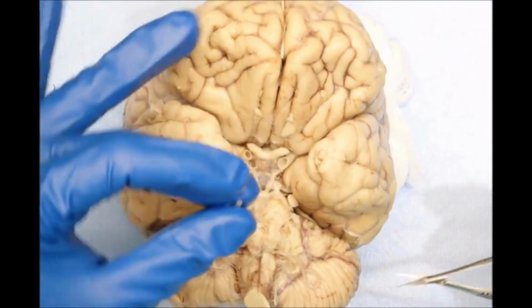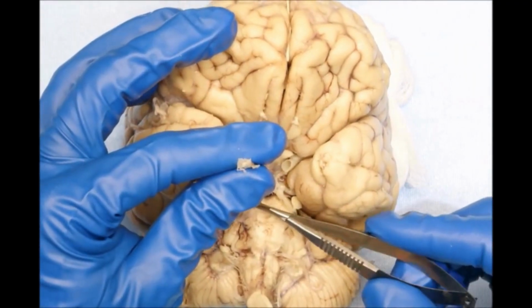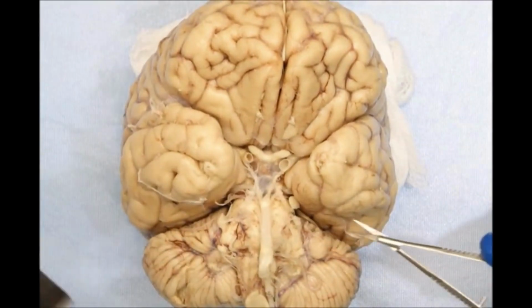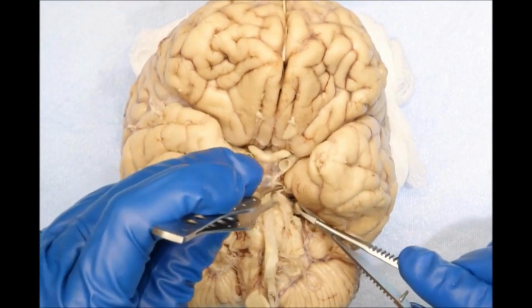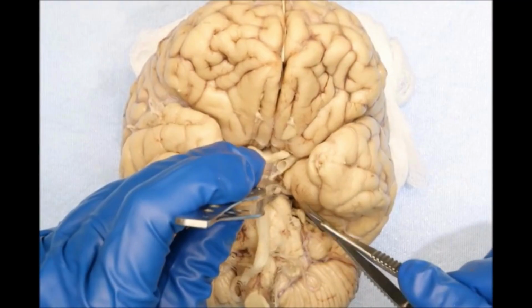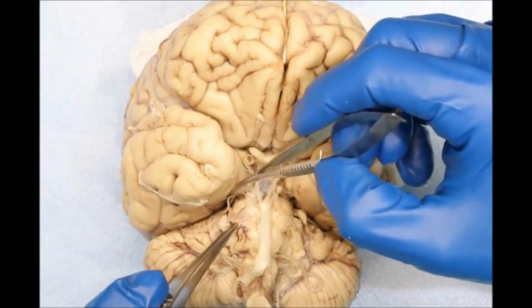I pulled up the basilar artery. I'm going to cut those deep thread-like branches that come off of these vessels, and try not to cut through the posterior communicating arteries.